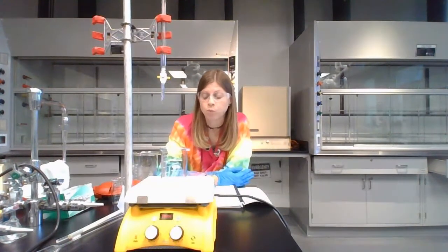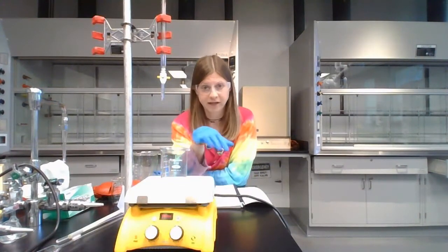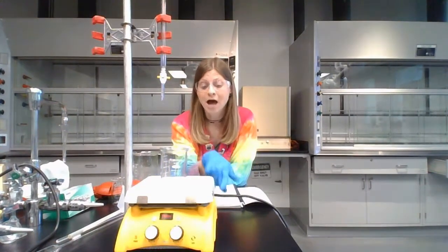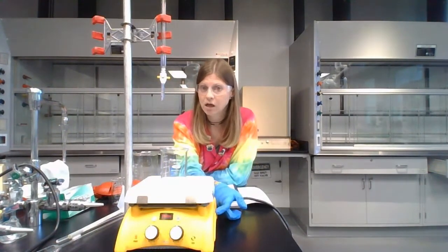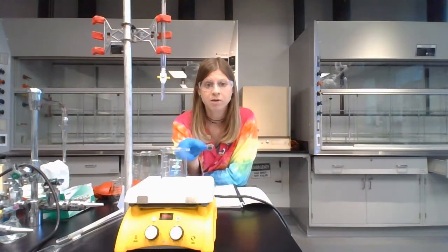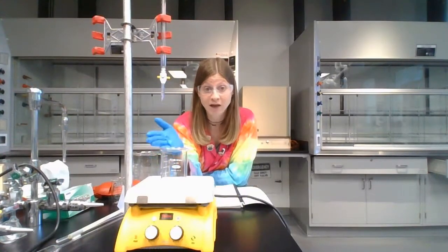Now, when these spills have happened, they are actually most often on our hot plate. So when we do this titration, and I'm going to explain more in a second when we go through the procedure, your hot plate will be on heating, and the stir function on the hot plate will be used to stir the stir bar. Because our solution is endothermic, which means it needs to absorb heat, we have to put it on the hot plate. So it is heating it while it stirs it.